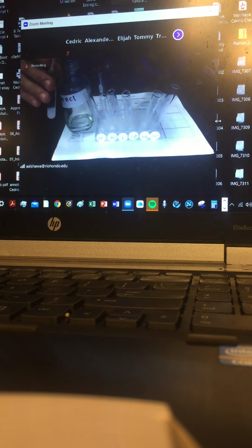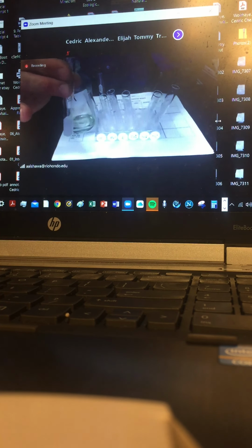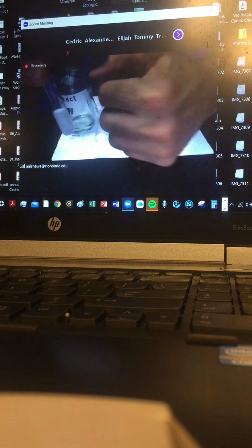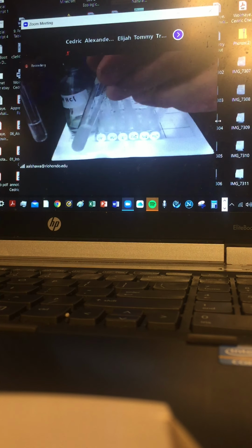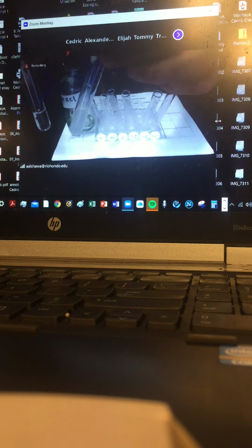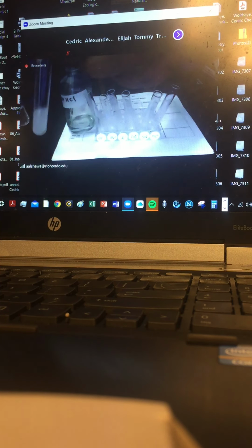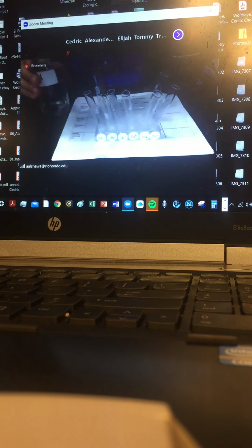Okay, so here's the addition of the acid. A little more, just to make the point. So this is unknown 2. It doesn't matter; unknown 2 sort of resists dissolving. Okay, so this is unknown 2. So this is unknown 1. So the barium chloride test to expose the sulfate produces negative for unknown 1, positive for unknown 2. All right. So that will conclude the second test.